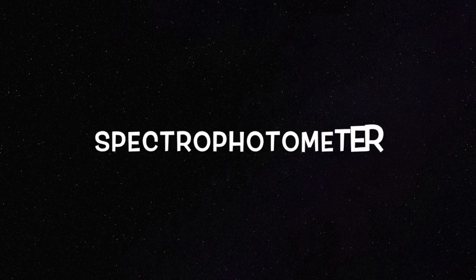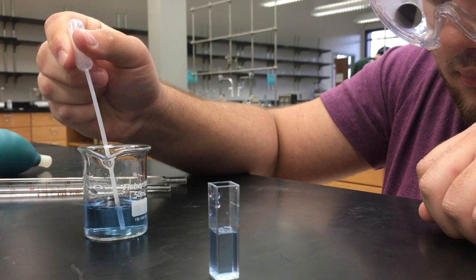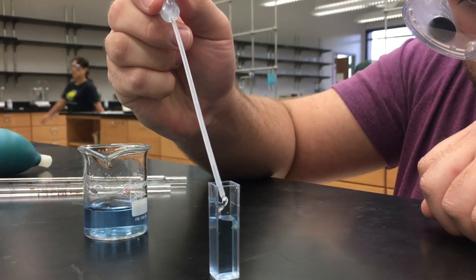Before beginning the lab, proper lab attire should be worn. Long pants, shirts with sleeves, closed-toed shoes, and goggles are acceptable.